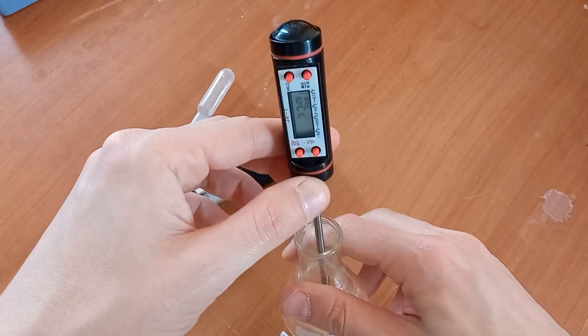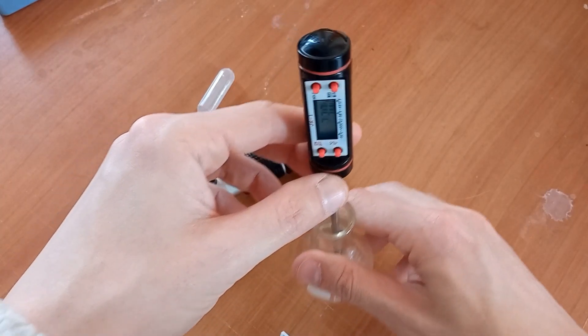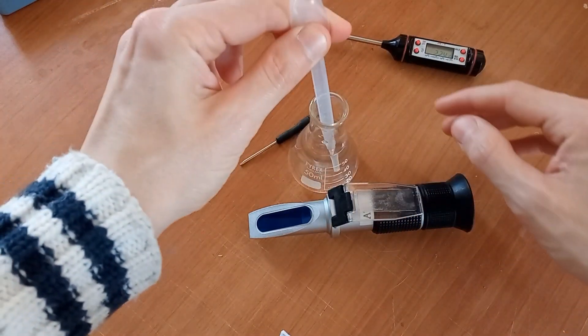Refractometer must be calibrated with water at 20°C before measurements. Our instrument is already calibrated but we show how to.